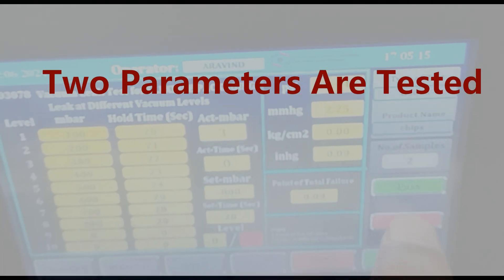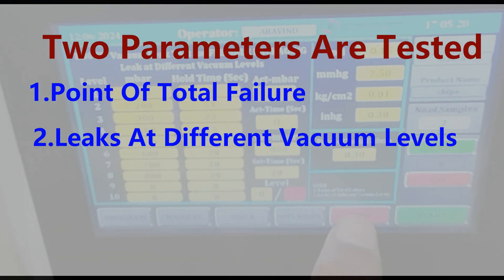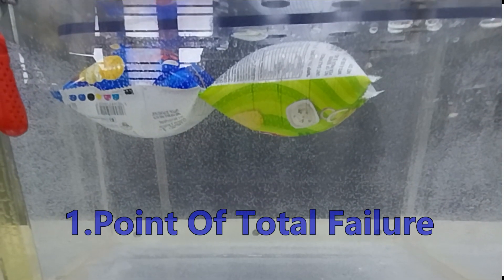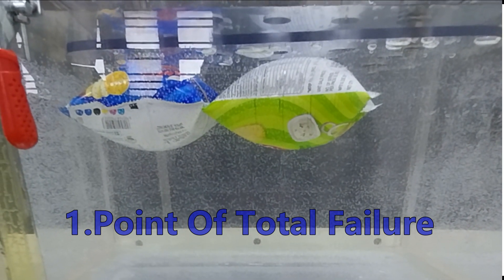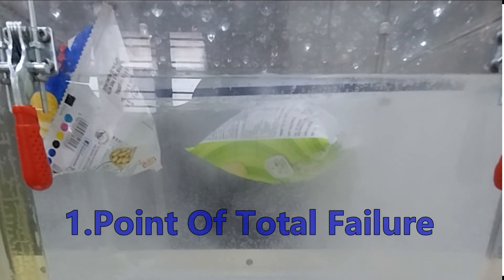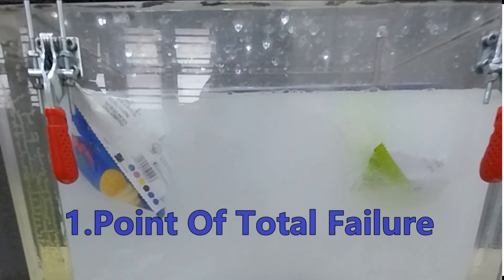We will test two parameters. First: Point of Total Failure. Second: Leaks at Different Vacuum Levels. To test the maximum level of vacuum that a flexible package can withstand, we will subject it to vacuum gradually until the failure of the package. Multiple tests will indeed provide more reliable results when evaluating the integrity of flexible packaging.